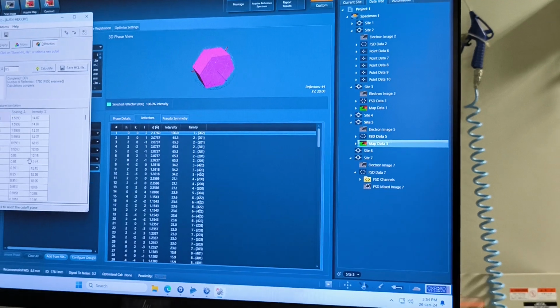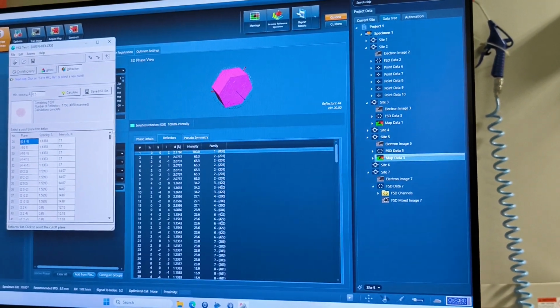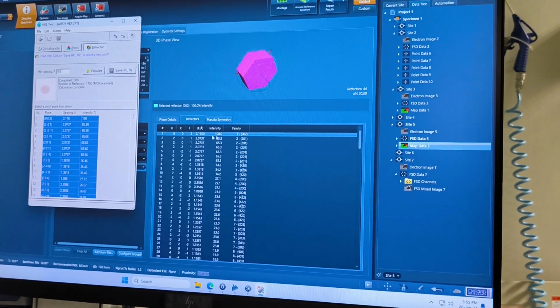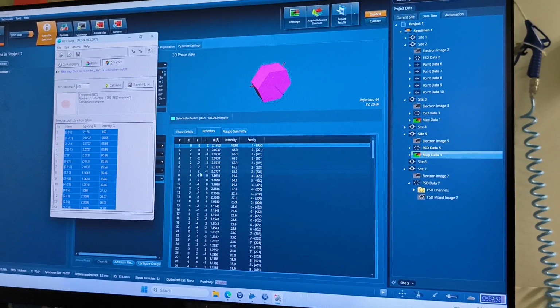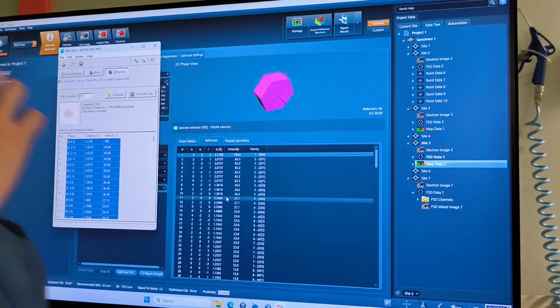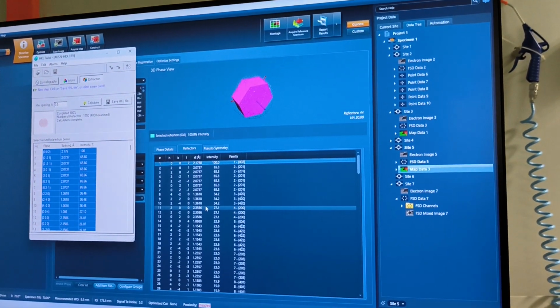You can check. They are similar, right? Because we need this to create the Kikuchi pattern. The Kikuchi pattern is also this one, right? By showing it in 3D space, right?